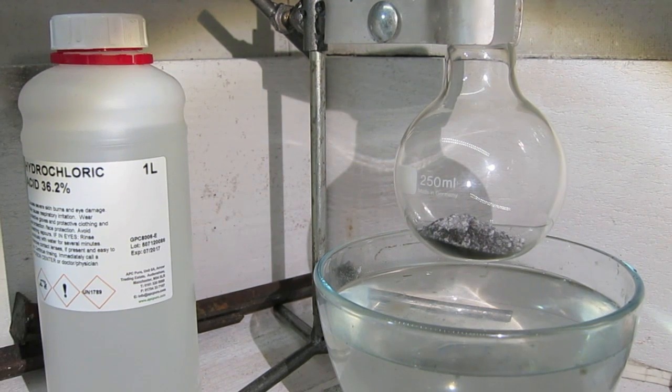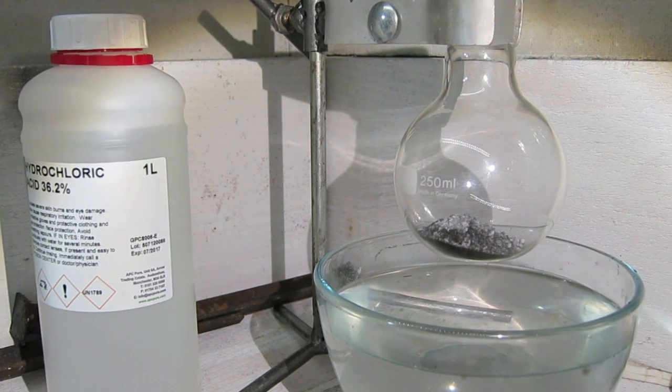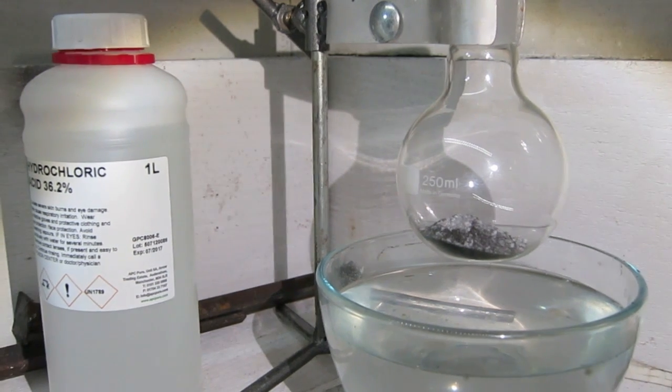But there is a warning again: bromine is a very toxic and very corrosive gas, so such experiments should only be done in a well ventilated fume hood or outdoors, because of the nature of bromine gas and even hydrochloric acid as well, because noxious fumes come from hydrochloric acid as well.